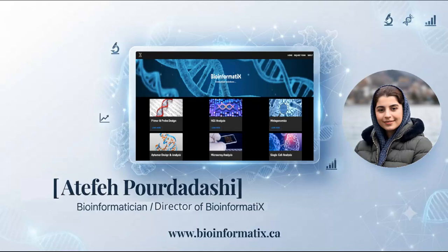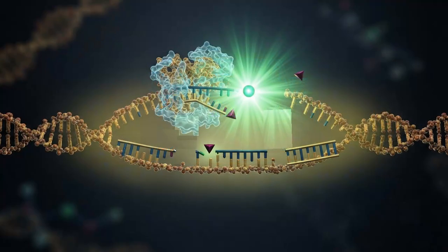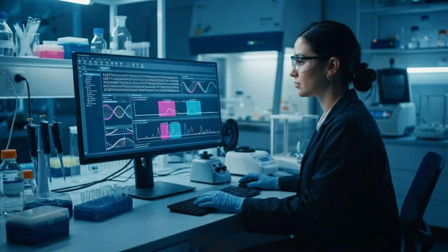Let's get started. We'll see how hydrolysis probes generate fluorescence, how to choose the best probe sequence, which design rules actually matter, and how to avoid the subtle mistakes that many researchers overlook. By the end of this video, you'll be able to design an entire TaqMan assay from primers to probe.